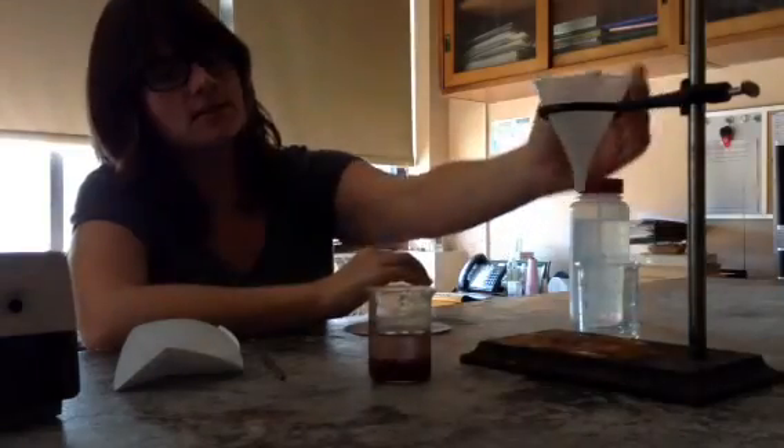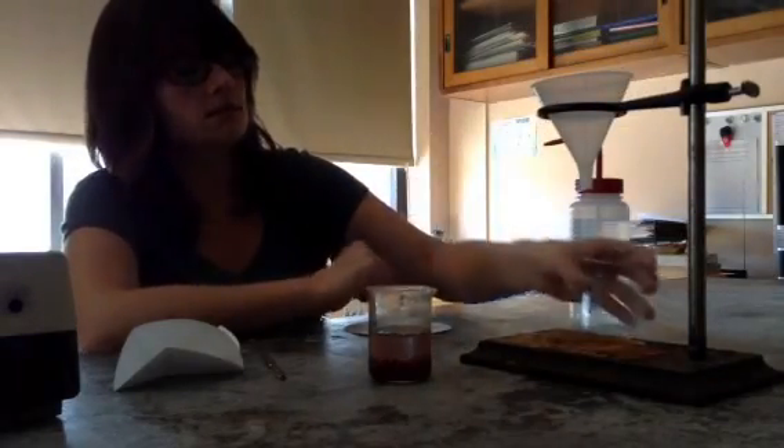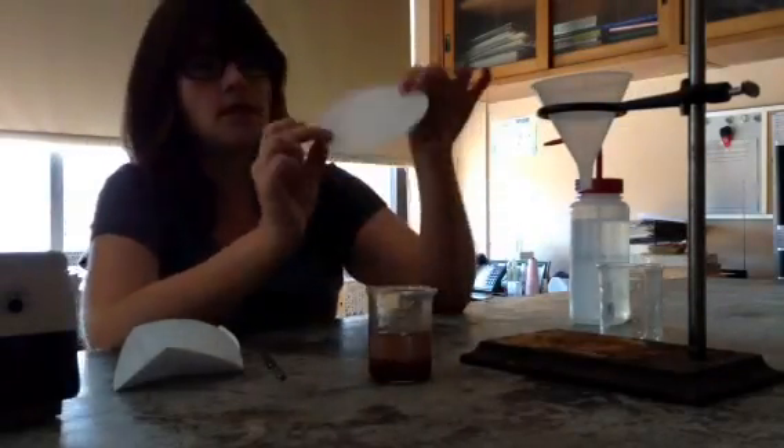To do that, I need my ring stand, a funnel, another beaker, and a piece of filter paper.